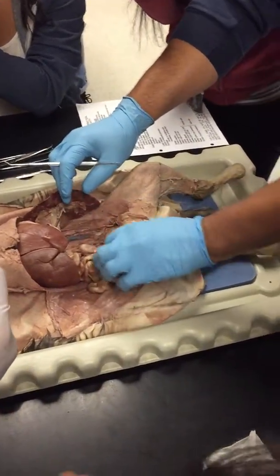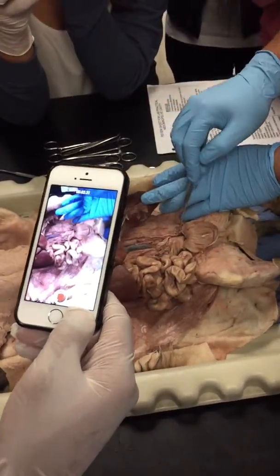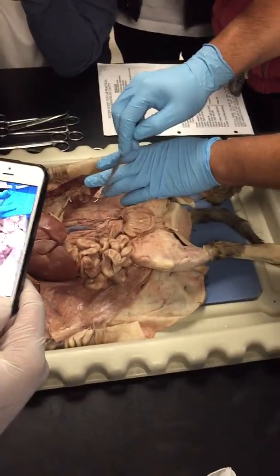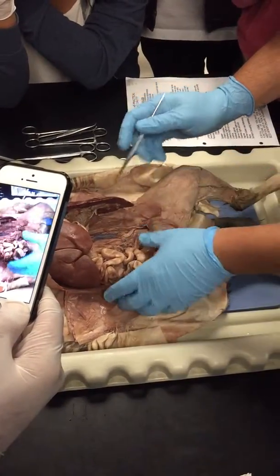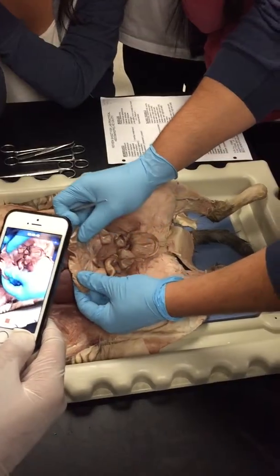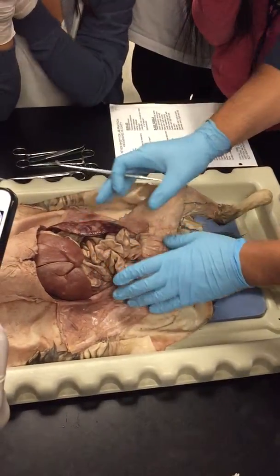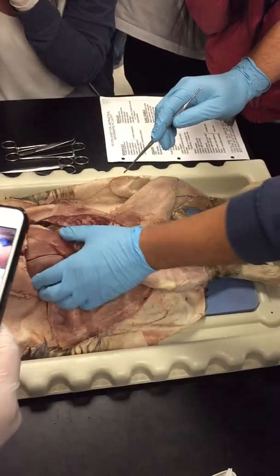Okay. All right. Now, do you guys remember the name of the membrane that was covering this area right here? Dorsal mesentery. Good. And then, of course, the true mesentery. Okay. Right in here is the true mesentery. So those are the membranes. Now let's take a look at the organs. Review the organs.